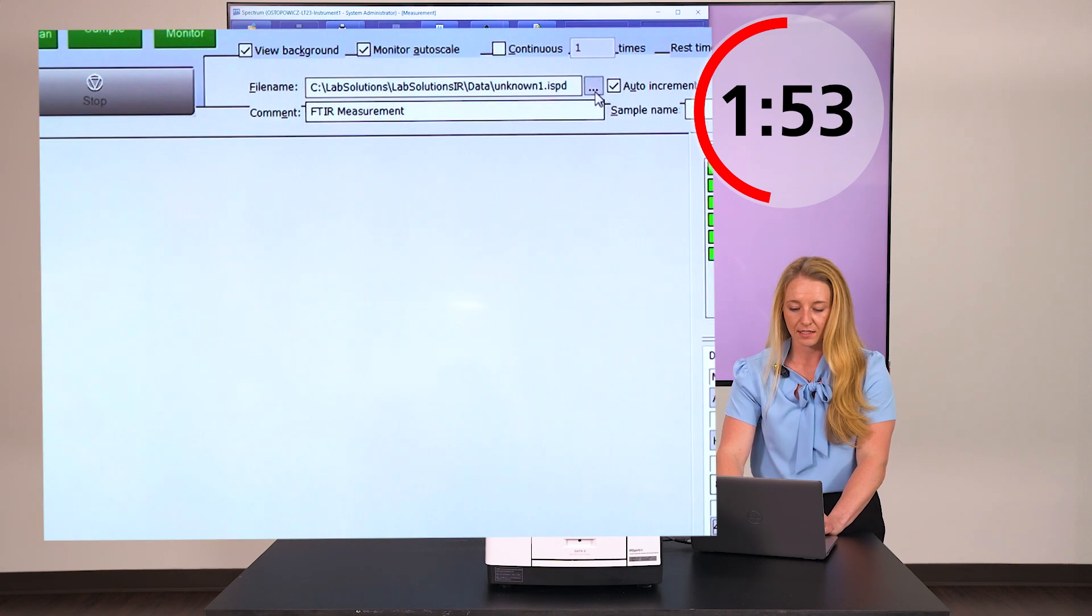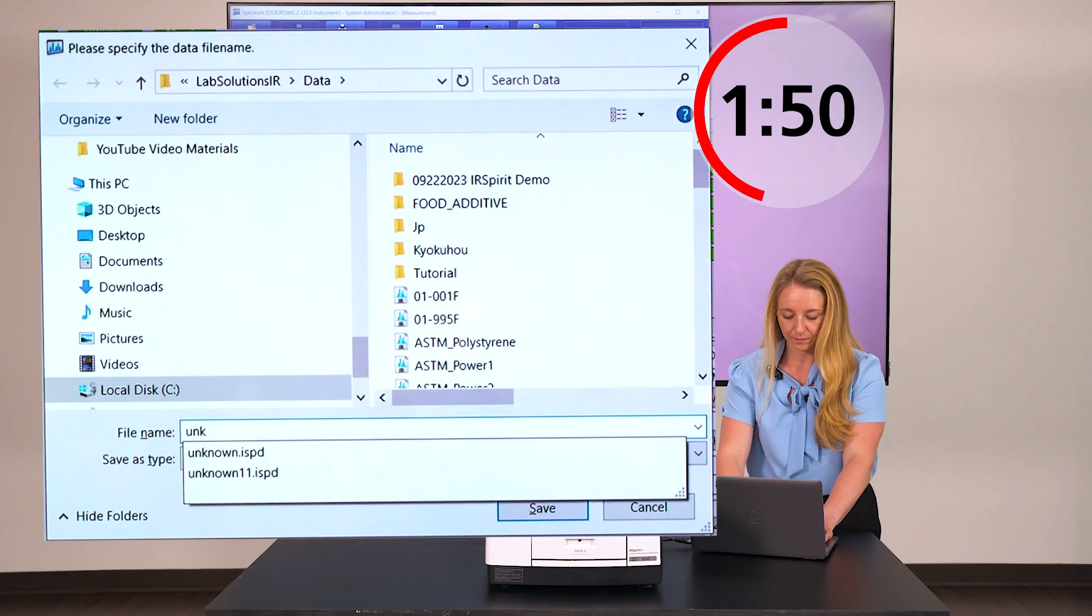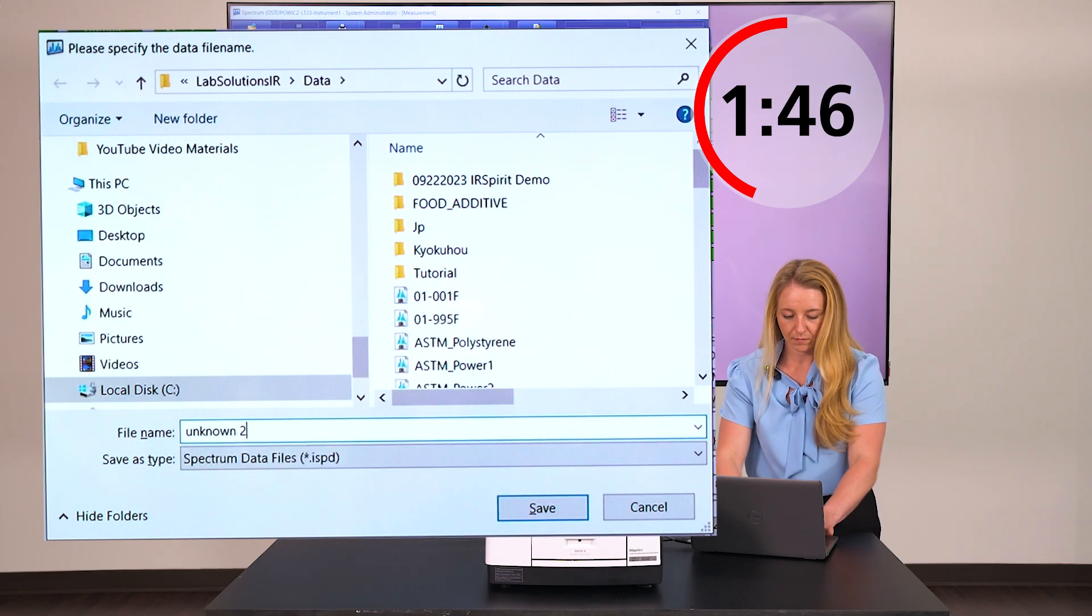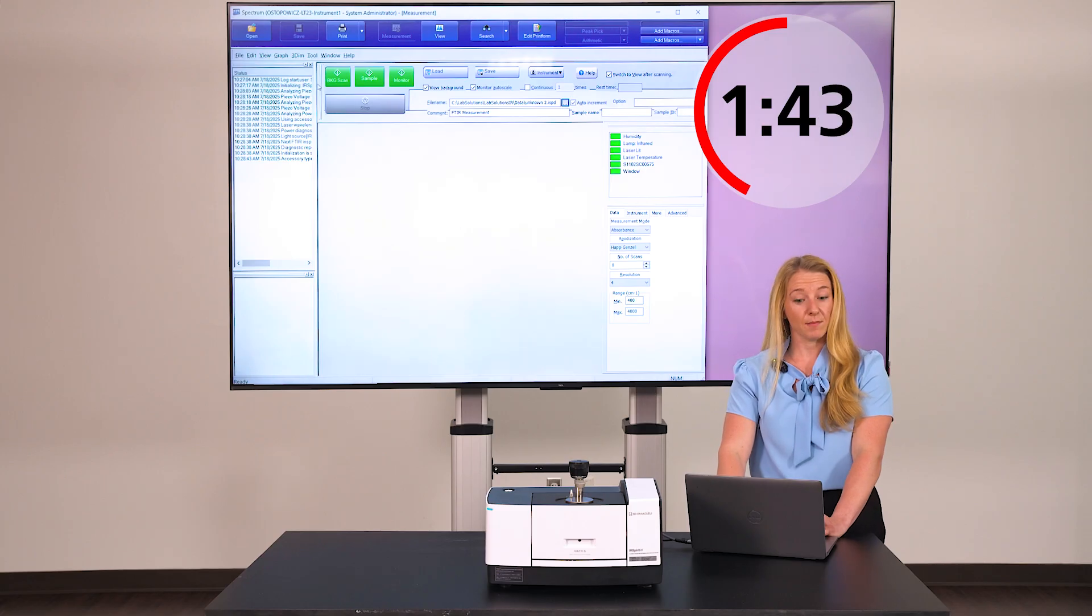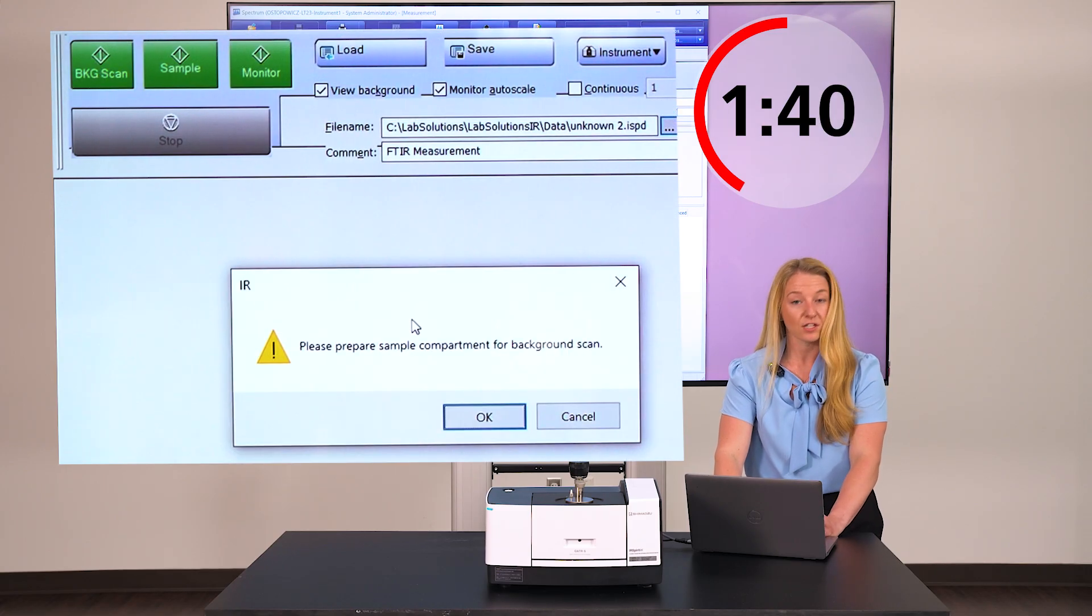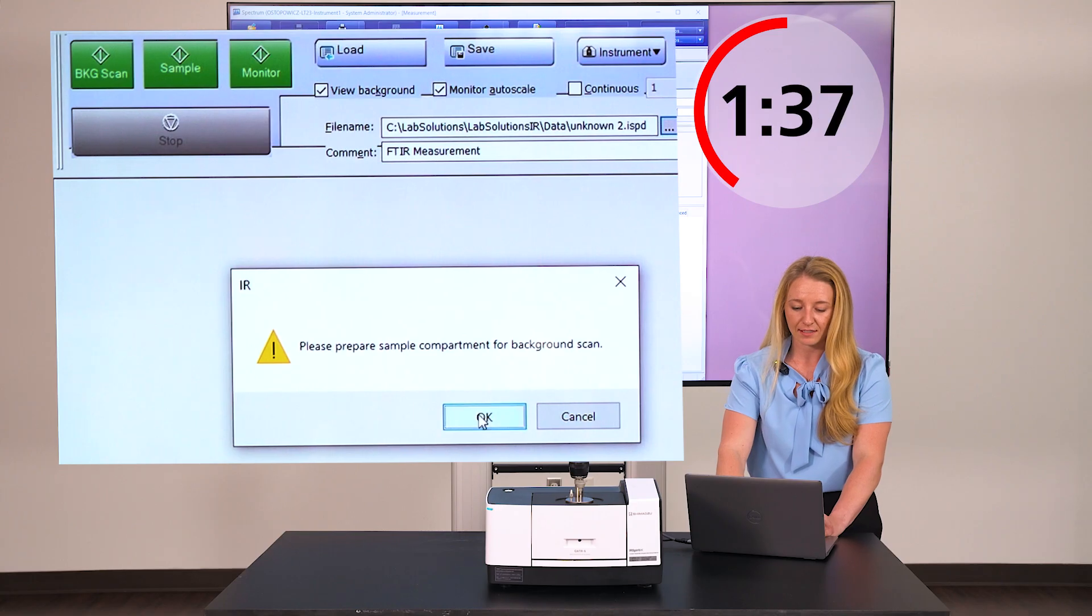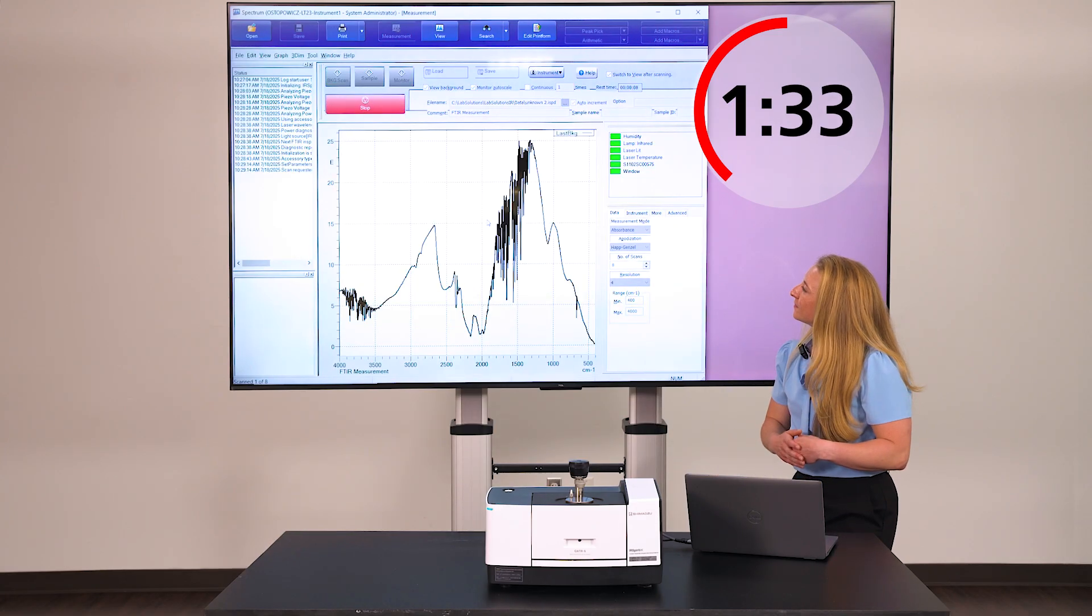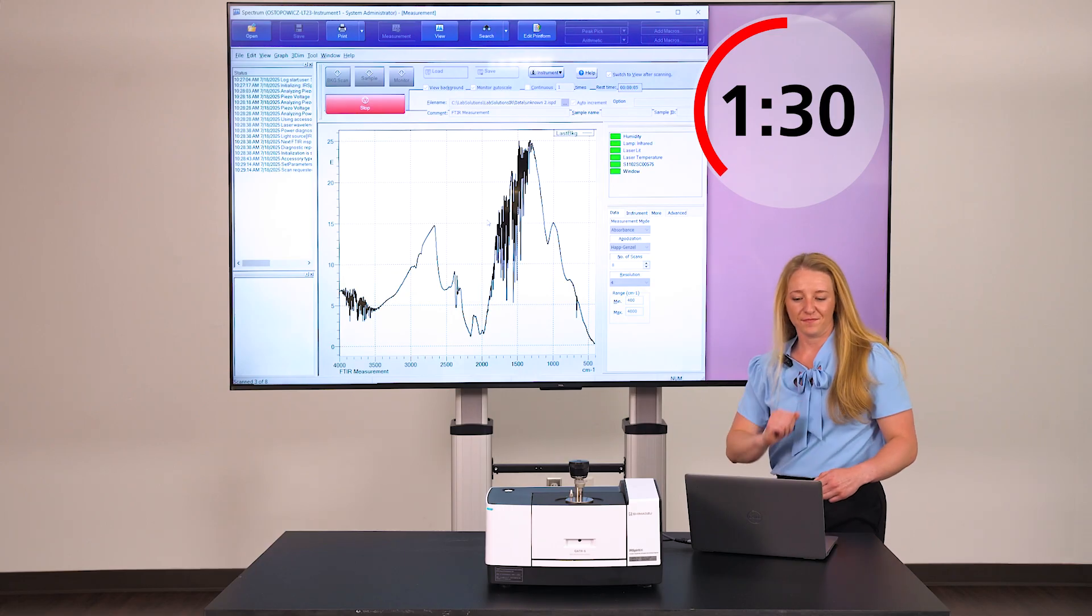I'm going to select the file name. And I'm ready to run a background. Click background scan and ensure the sample compartment is ready for analysis. Click OK. And here's a background spectrum of our ATR.